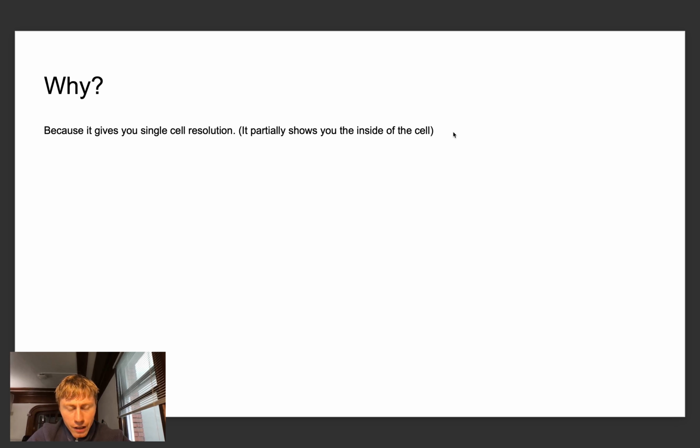It enables us to go a little bit further. What is missing, of course, is the spatial part, which people have also started on. Basically you can have the tissue, look at how it's structured, all of the collagen, the proteins, the glycoproteins outside, and then you can also have the cells, see them, and then see inside them.